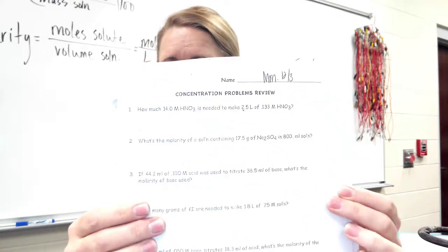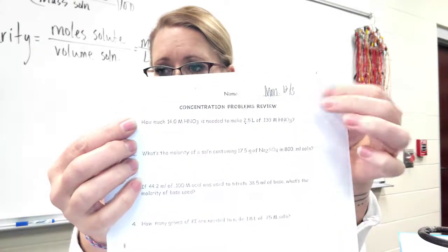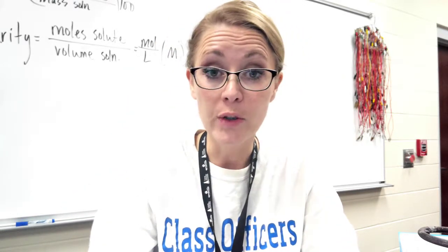Concentration problem review. Monday, 12/3. There's your homework. All right, guys. You're fantastic. Hot things look like cold things. It's salt water. It won't hurt you, but the Bunsen burners can burn you, so pay attention. No hot things on the electronic balances.